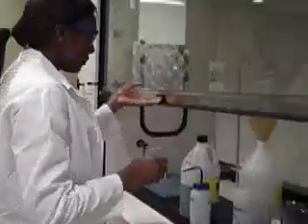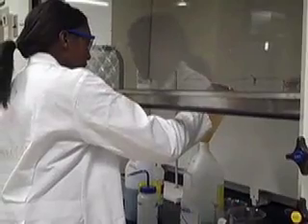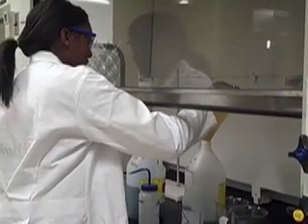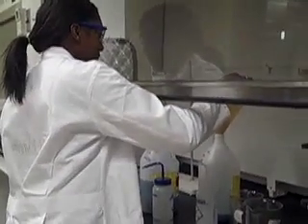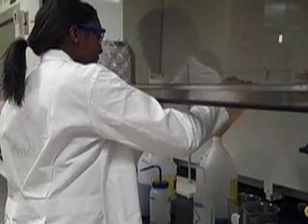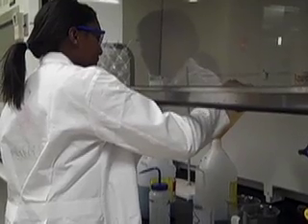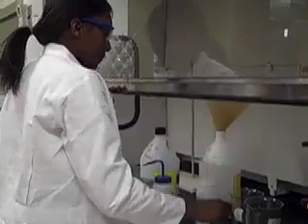Some chemicals you use in the laboratory will not be able to be disposed of down the regular drain. If you dispose of these chemicals down the drain, like Nick did, you could potentially harm wildlife in the area by polluting streams and local groundwater. Steph is showing us how to properly dispose of those chemicals in the hood using a funnel and the waste disposal jar.